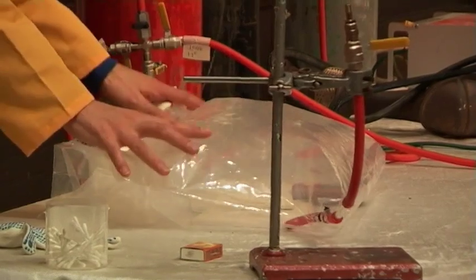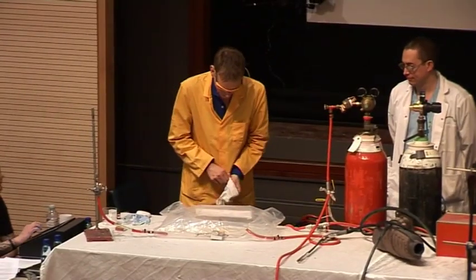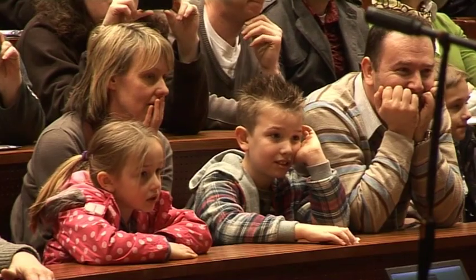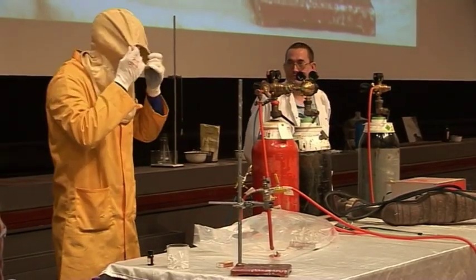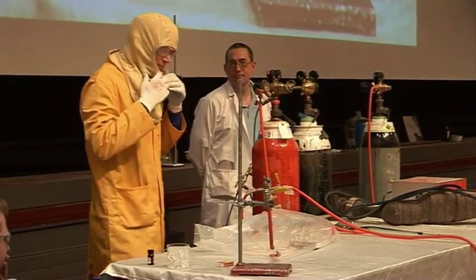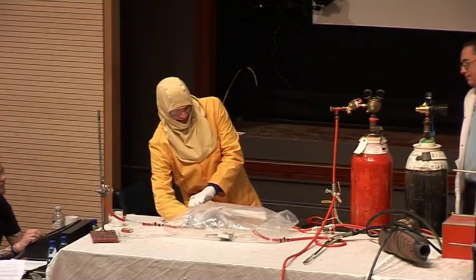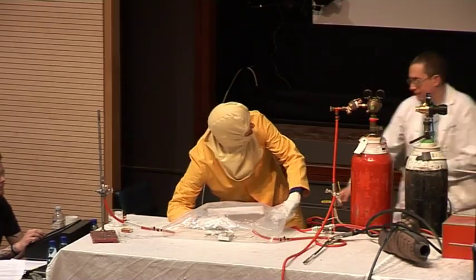So in the bag here, well, we've filled it up with hydrogen gas. All right, just to be safe here. So I'm going to strike a match inside, if I can get my hands in here, inside this glove bag. Sorry, can you give me another hand, please?